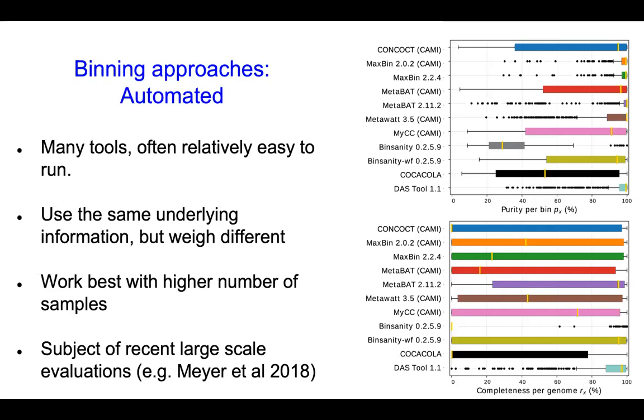In these things it's often the case, the more samples, the better. So if you find yourself in the project design stage of a metagenome project, try to arrange such that you have a library that is split along a time series, or multiple samples from similar but related locations, or even different DNA extractions from the same sample, or another way of splitting the sample, so that you can get leverage from that differential abundance across your samples into the binning of your contigs later.